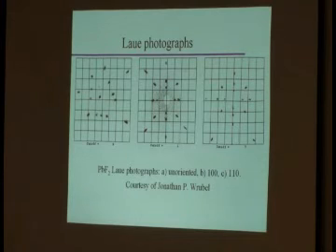A mess, in short. Okay? Spots all over the place. What's the reason for that? Well, when you put your crystal on there, chances are you don't have them aligned in any type of crystal axis towards the X-ray beam. Okay? So, you get a mess.